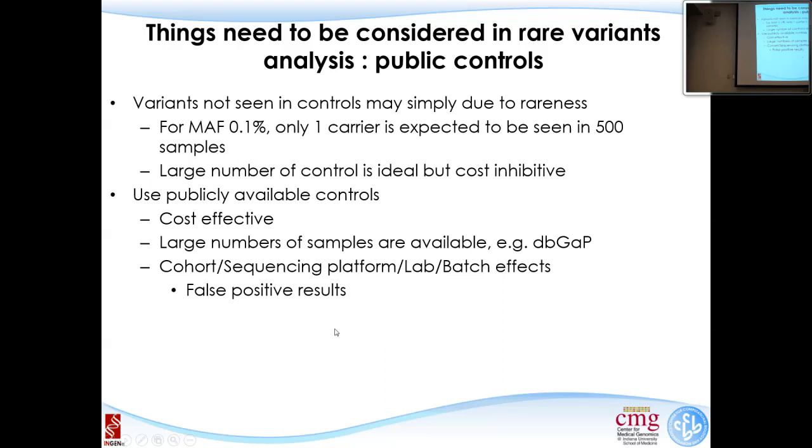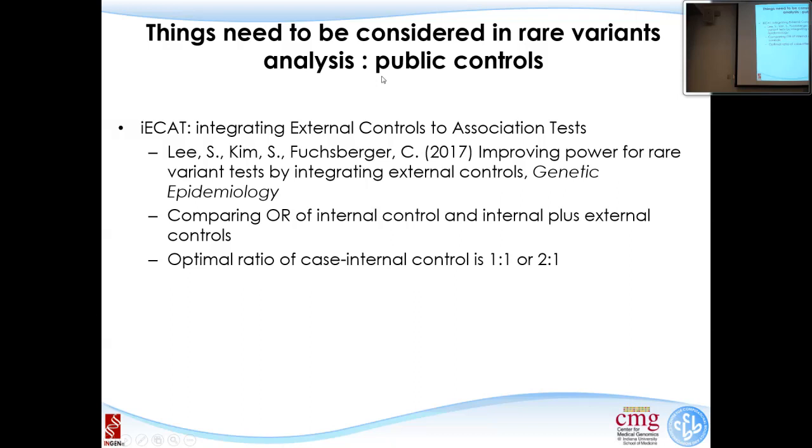This is really a nice program to remove those batch effects. This is the paper. It's a kind of statistics, so you just need to know this paper over there. And then this is their basic principle.